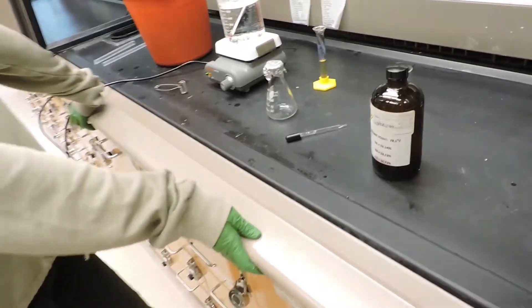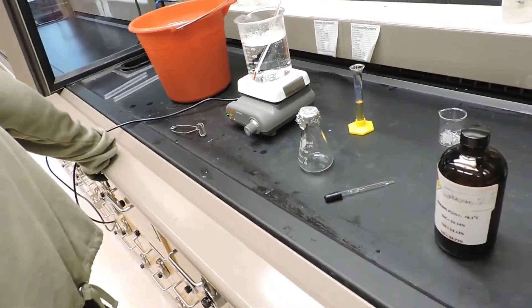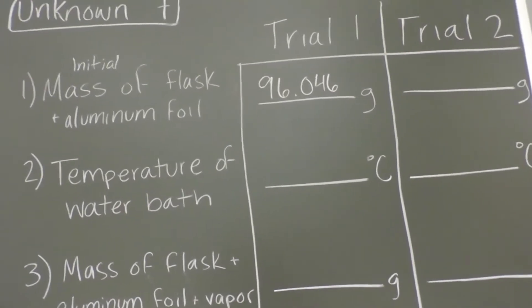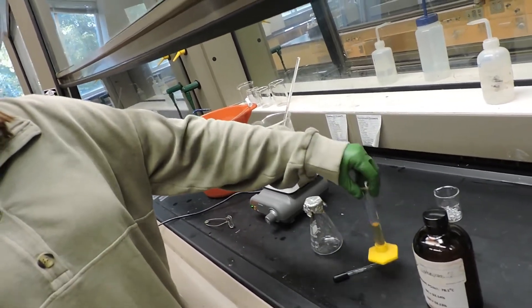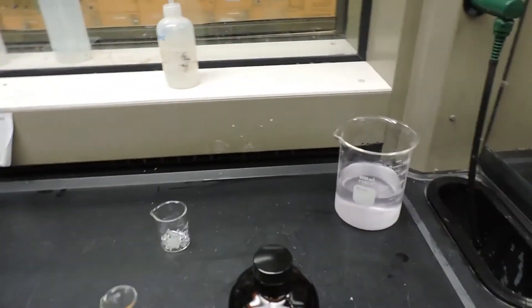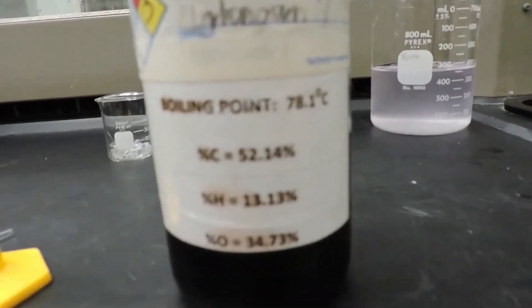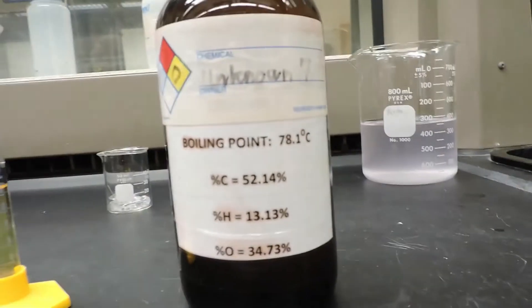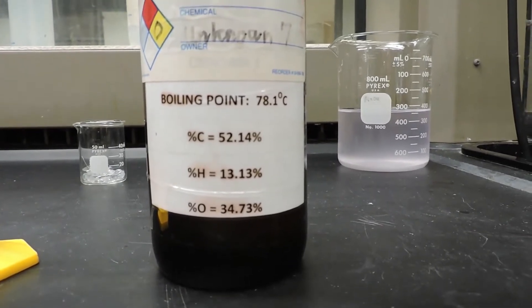Later we'll put a hole in the top using one of these pins. The first thing we're going to do is find the combined total mass of this Erlenmeyer flask with the piece of aluminum foil. For the first trial, the mass of the flask and aluminum foil is 96.046 grams. We'll use a 10 mL graduated cylinder to measure approximately 6 milliliters of our unknown liquid — unknown number seven — with a boiling point of 78.1 degrees Celsius. The molecular components are 52.14% carbon, 13.13% hydrogen, and 34.73% oxygen.